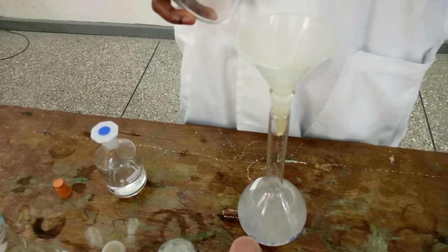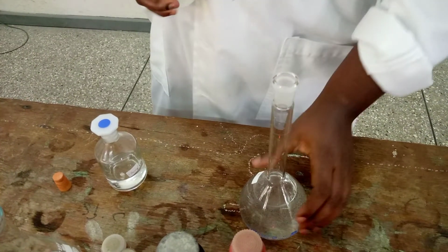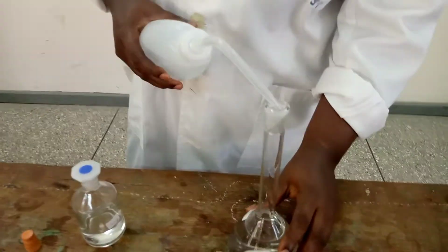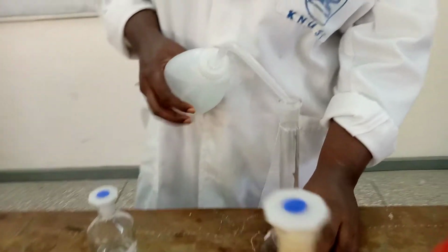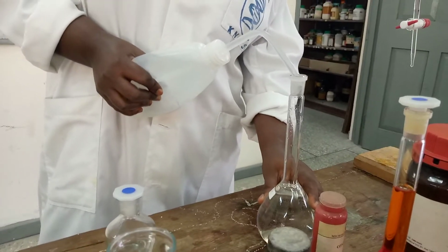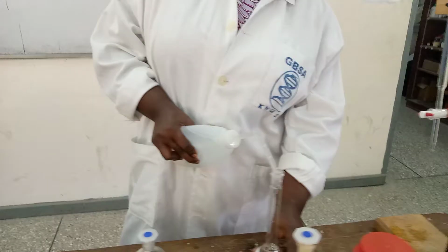We take the funnel off. Then we top up to the meniscus. You have to top up to the meniscus. My volumetric flask is a little bit hot. So I'm topping up to the meniscus. That's what I'm doing now.